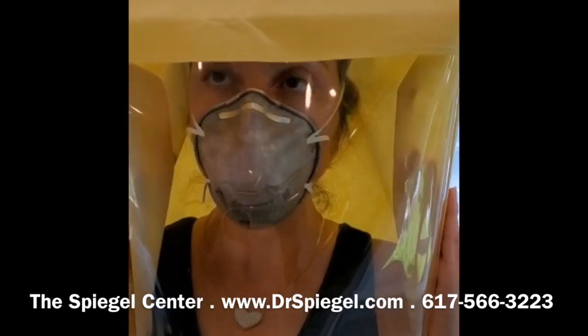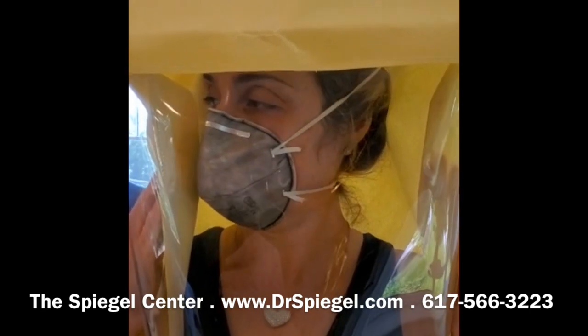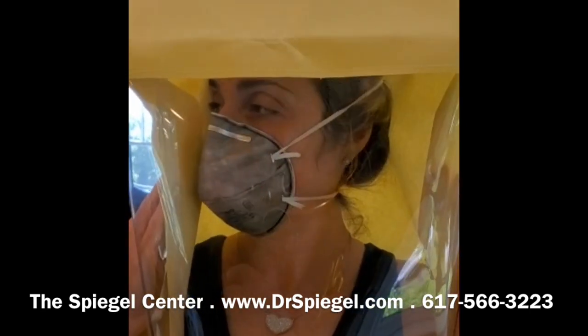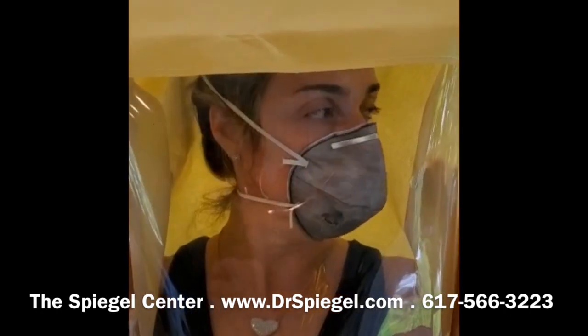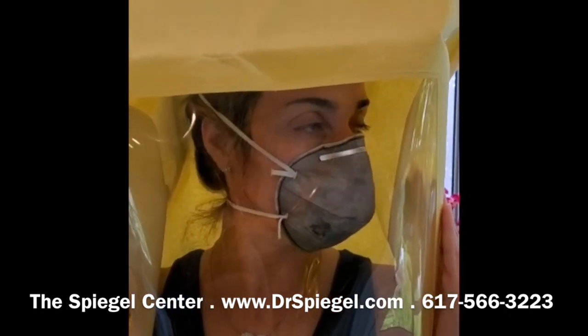Following this, the subject should turn the head from side to side for 60 seconds, breathing normally. At any time that she detects the taste of the test solution, you will know that this mask is no good.